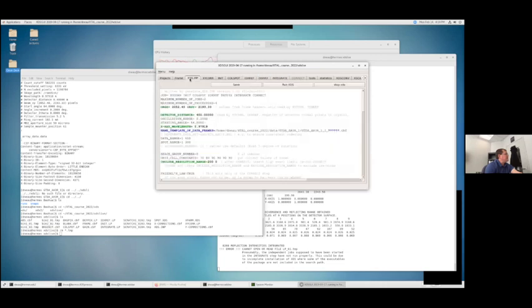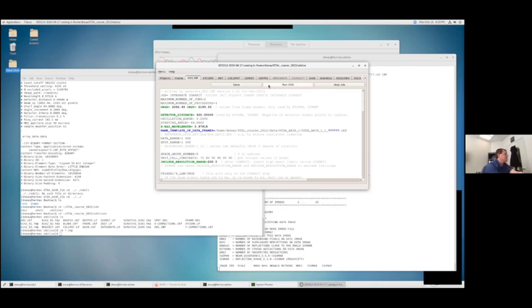So when I come back to XDS.INP, I'm going to go to my job control and say I want it to start with integrate and end with correct. I don't want it to do any of the other ones, so I put the exclamation point and commented them out. I change that, save it, and run the process.